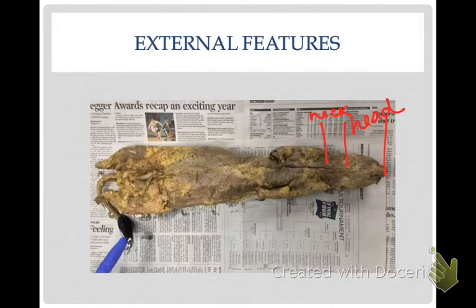And then we have another region that I call the armpit region. So it's hard to see, but it's going to be that portion which would look like the armpit of the mink. That is called the axilla region. And then the next part we're going to look at is going to be the thorax. So that's going to go from the neck down to this area right here. So that's going to be the thorax.